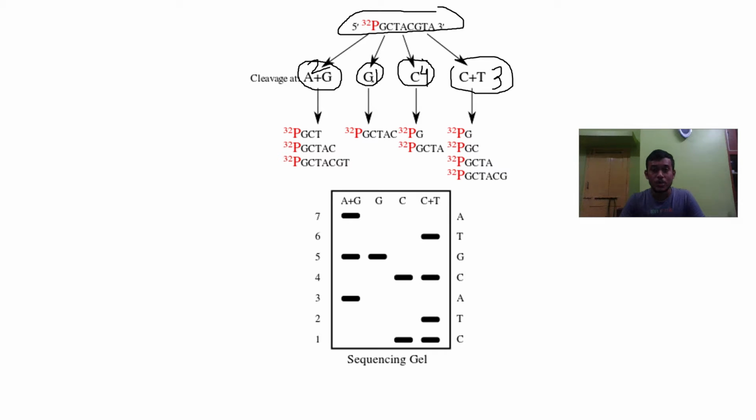Talking about the first aliquot, which is the G aliquot, it will try to remove the G bases in the single strand DNA. This aliquot will take only those sequences which do not contain G bases. You can see this is the starting material. I'll write it boldly for you: G, C, T, A, then C, G, T, A, and C, G, T, A as well.